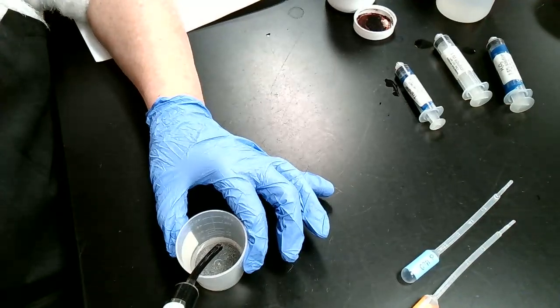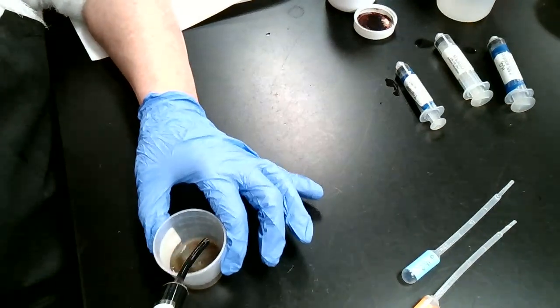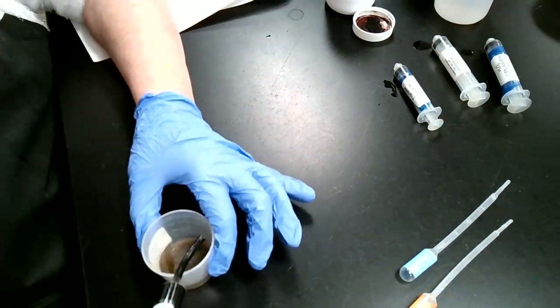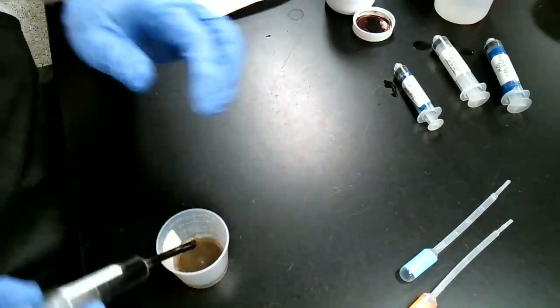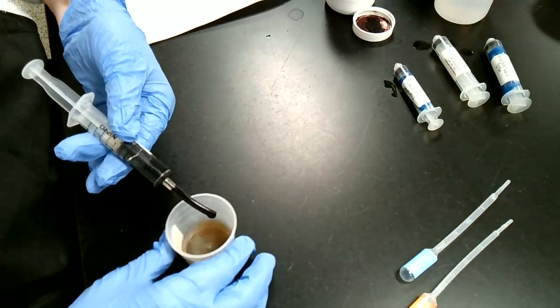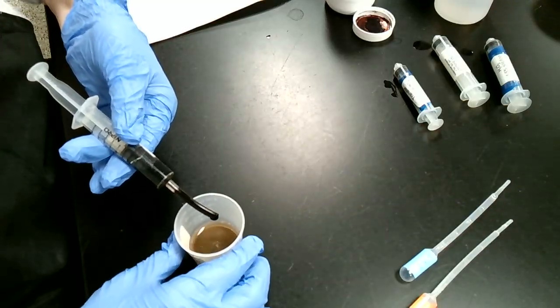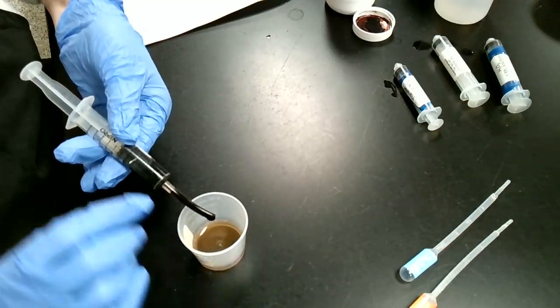Here, I'll make sure you can still see this. Okay. Ooh, that's looking nice. It's looking like it's staying, but let me give it a good swirl here. Let me hold this gently over here. Looks like that color's staying here. Okay, so since that color has changed and remained, I got to stop now.